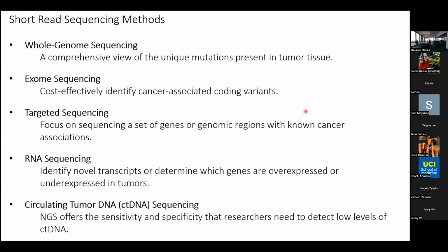We do a lot of exome sequencing, for people that don't want to pay for whole genome. Right now we're doing a 39 megabase region that represents human exomes, so it cuts down the cost. For human exome, library prep and sequencing is about $200. So that really puts it into an area that's pretty affordable.